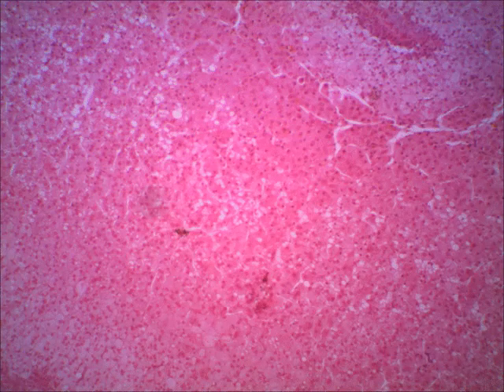If you look at the cortex very carefully, it's hard to see on this scanning magnification, but in the cortex, the cells are somewhat lined up. So that's why sometimes on some drawings, you see stripes in the cortex, like I'm trying to draw here. You'll see stripes. That gives you an indication of the way the cells are arranged. They're arranged in columns. All right, if I erase that, and then look at this center area, this is the medulla. And the cell arrangements are very different in the medulla. They're more in clusters.